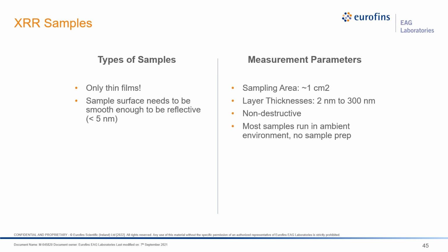such as surface roughness and density, this technique won't be able to tell you anything about the thickness of that film. At thicknesses like this, we would hand it off to our optical profilometry experts down the hall, and just like with XRD, this technique is non-destructive, runs in an ambient environment, and requires essentially no sample prep.